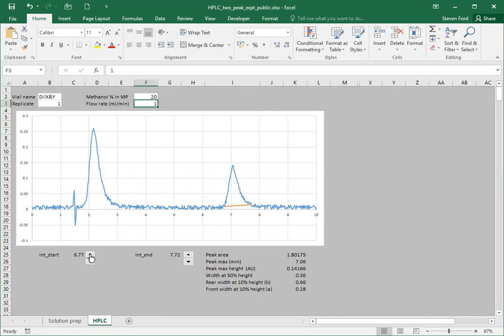So you can see that I've had to change the values slightly there because I think it just needs to match up. There's 2, oops, yeah, that's right. I just needed to get a proper integration.